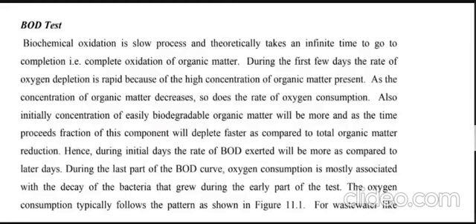after 3 days or 5 days, there is a 5-day test. After the 5 days, again we note down the DO, and that depletion is nothing but the organic matter which is present. Okay, so this is the simple way. As it is said, the biochemical oxidation is a slow process and theoretically takes infinite time.